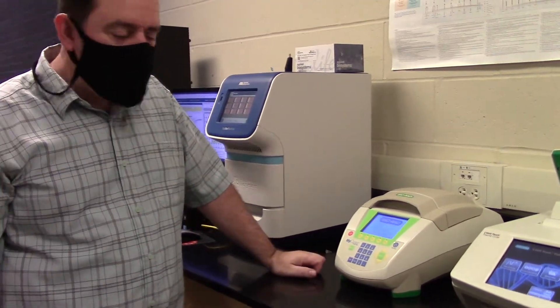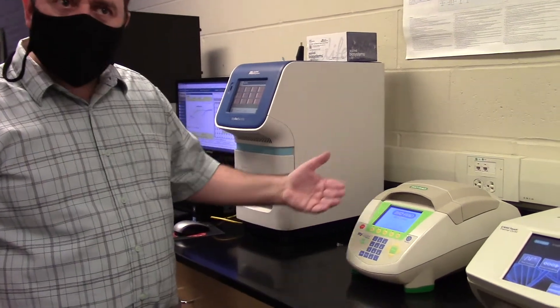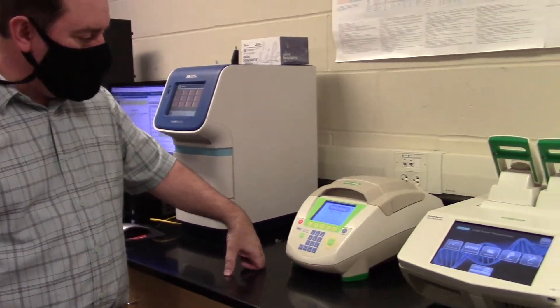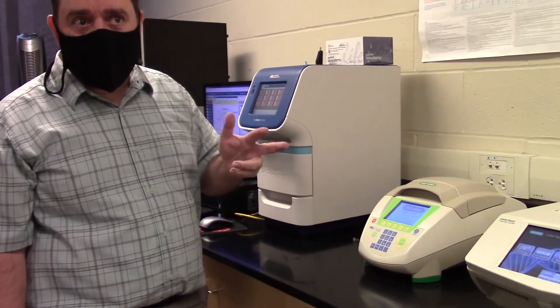This machine right here is a PCR machine — polymerase chain reaction. It's going through some self-checks right now in order to be activated and make sure that it can control the temperatures as we go through the three steps of PCR.